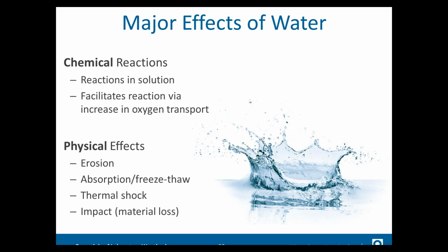And one thing to note is there was a standard that was developed recently, and the reason the standard was needed is for automotive coatings. They found that over the course of between the 70s and the 80s, they made automotive coatings very, very durable in regards to ultraviolet, so they can keep color and they can keep gloss. And that's why you rarely run into the fading that you used to see in vehicles. But now almost all the failures of paints that you see are blistering, cracking, crazing, and these are all artifacts of water. And these are harder to test because the tests that they were using were very good at simulating the UV, but not as good at simulating the effects of water.